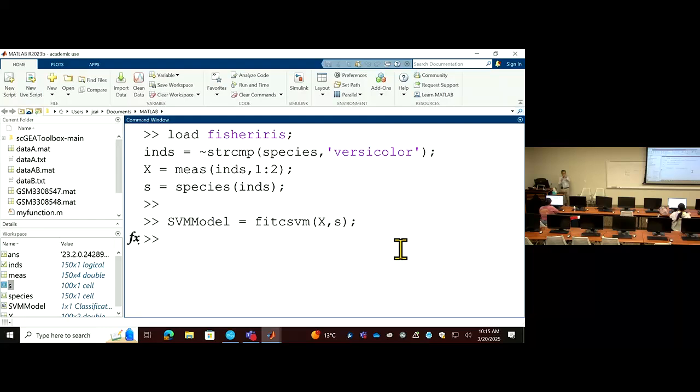There will be a hypothetical separation line between these 2 groups of data points, and a lot of computation to compute the distance from the data points to this line. All this computation is done using matrix multiplication. After that, it changes and finds the best solution at the end. So that's what's going on under this algorithm.